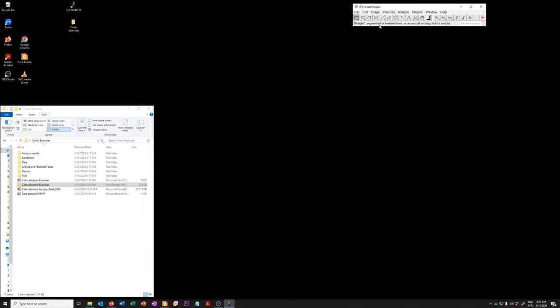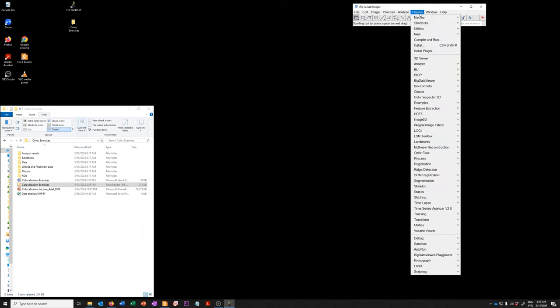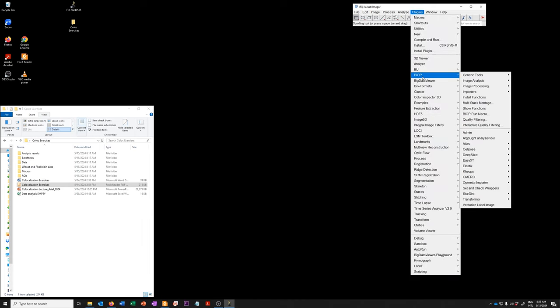Second, in Fiji, install the PT-BIOP plugin using the Fiji updater. If you did that successfully and you go to the plugins menu, you'll see that there is an entry called BIOP, and within BIOP, within image analysis, there will be something called BIOP JAKUP, which stands for Just Another Co-localization Plugin, and that is the main thing that we are going to use for the co-localization exercises.